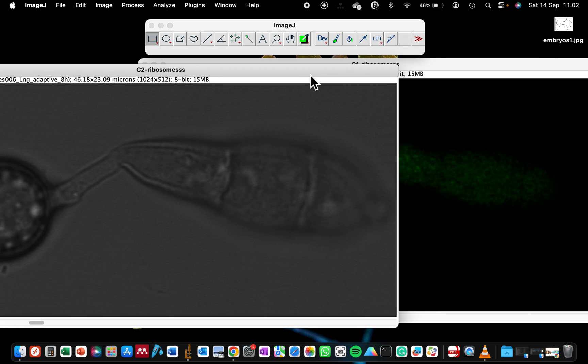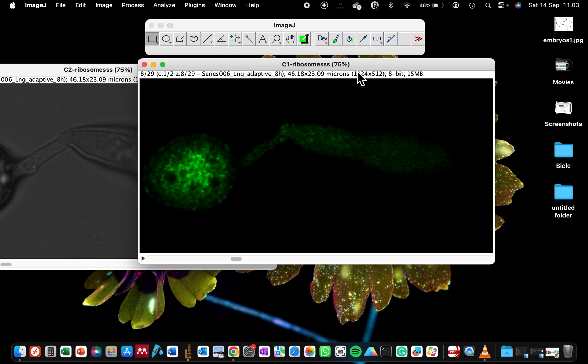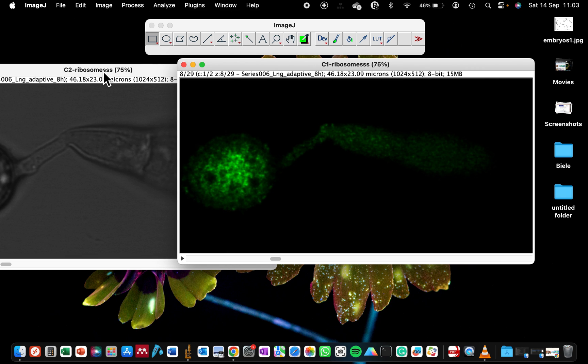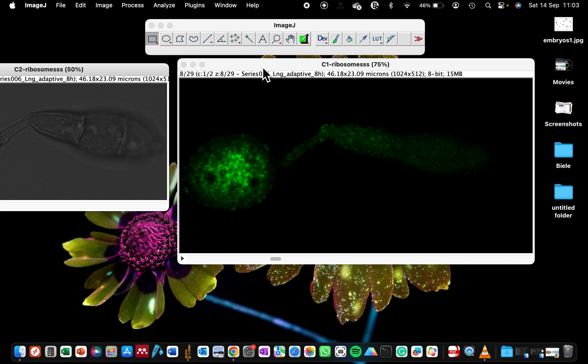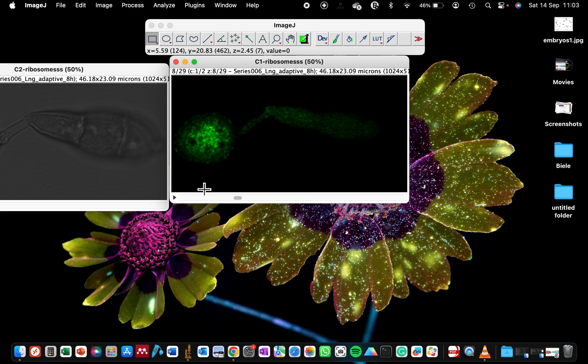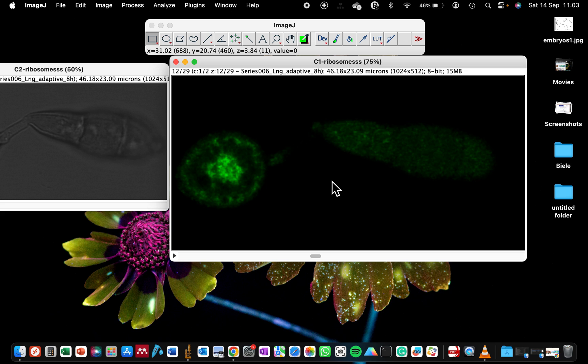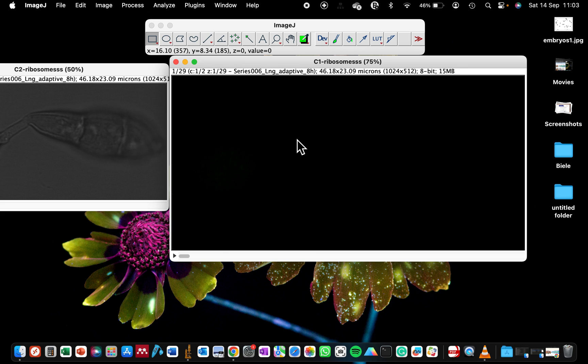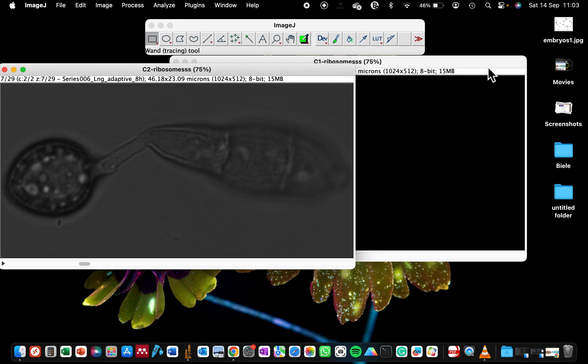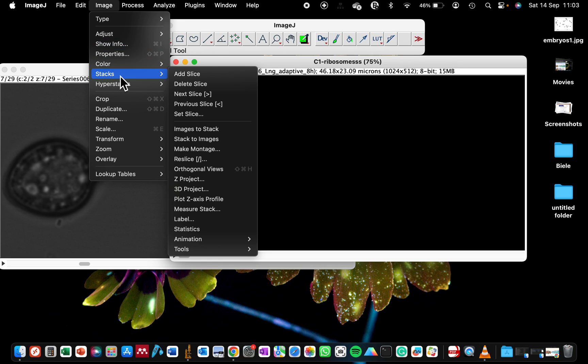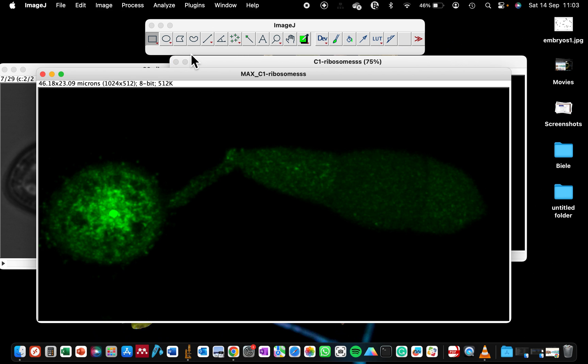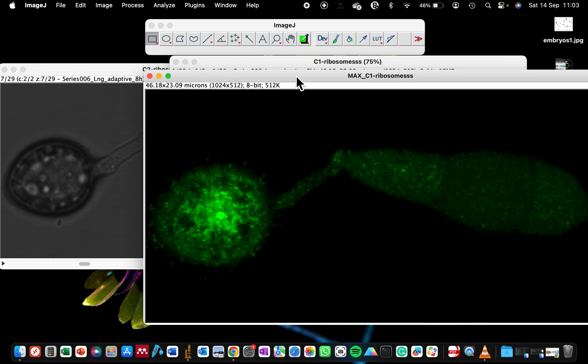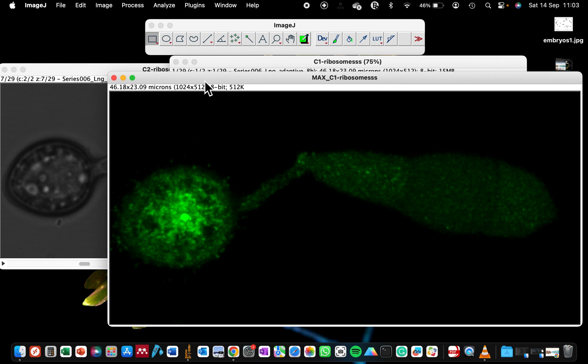These are the two images. For making the representation, because this image is my stacked image, I will first project it into a maximum intensity projection. Click on this, go to Image, Stacks, Z Project to make a maximum intensity projection. Now I have all the different slices together into a single projection.